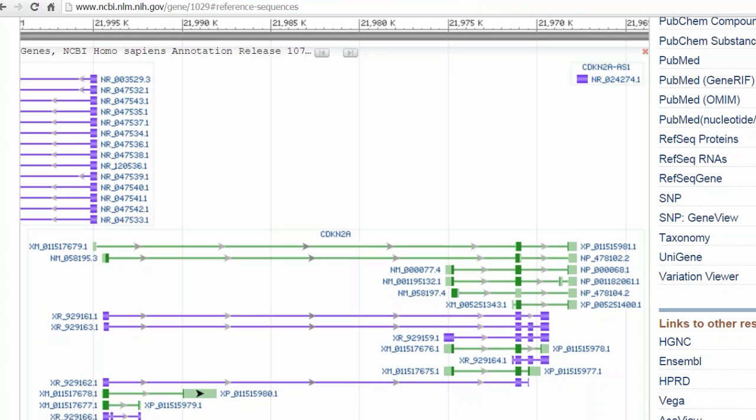I didn't mention this, but I will mention it right here while we're looking at these. Notice that there are 2 kinds of transcript accession numbers. The XM accessions are the ones that are dependent on that RNA-seq data. These are gene models, I would think of them that way. And they're considered to be associated with the build itself. So they're not instantiated from pre-existing or standalone sequences in GenBank. The NM RefSeqs, the ones we're going to be focusing on today, are based on standalone sequences in GenBank. And there is one of interest right there.